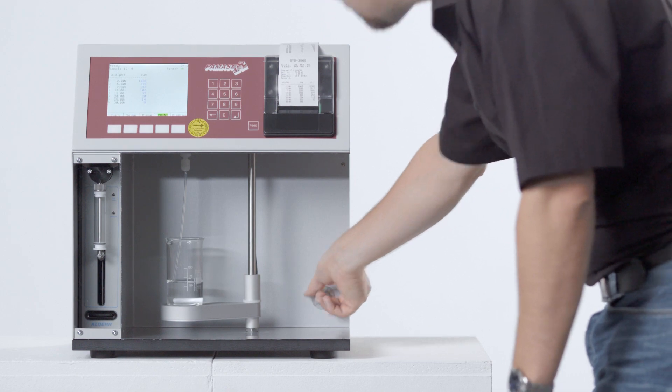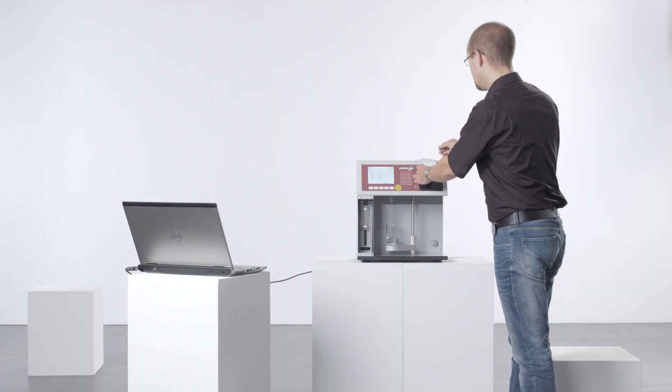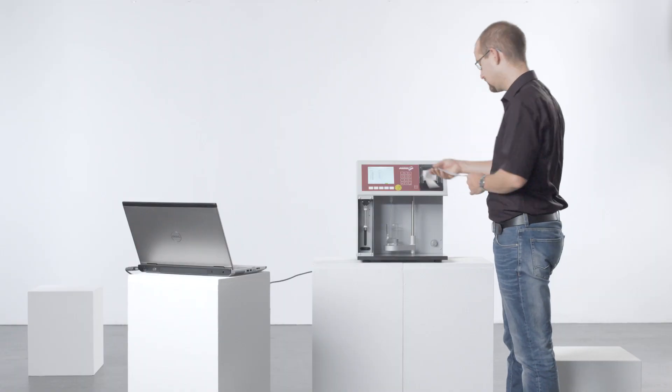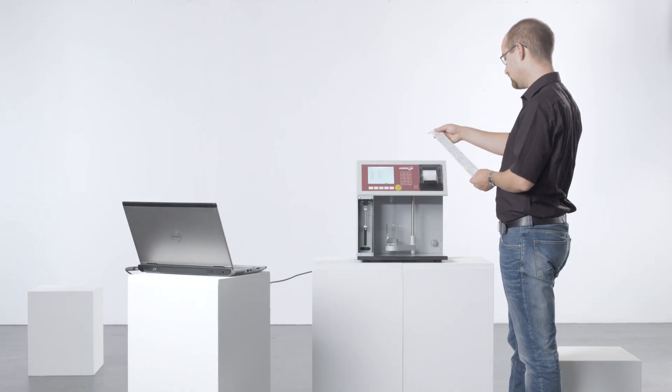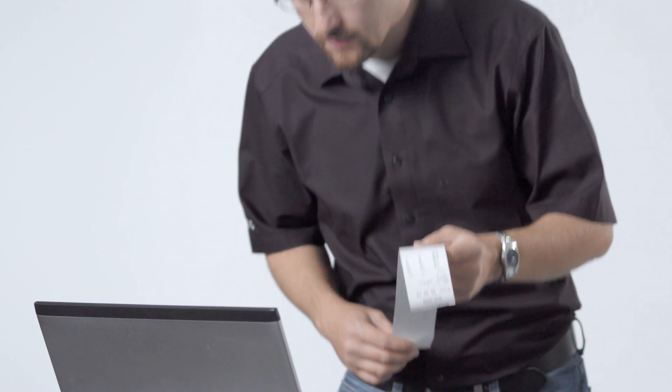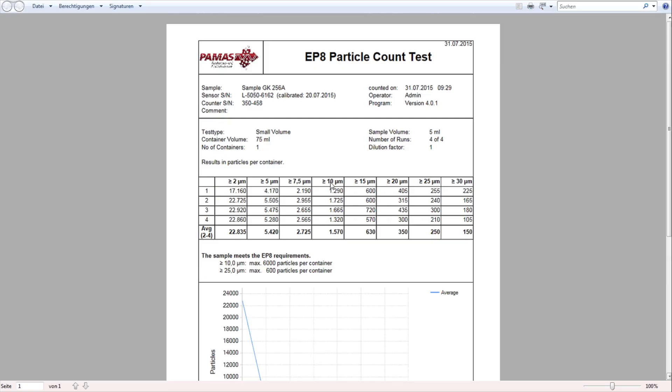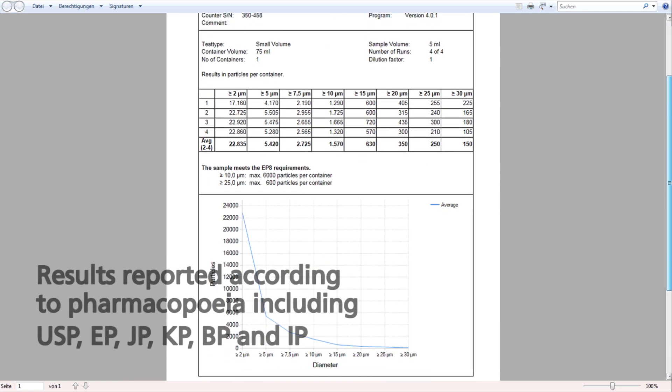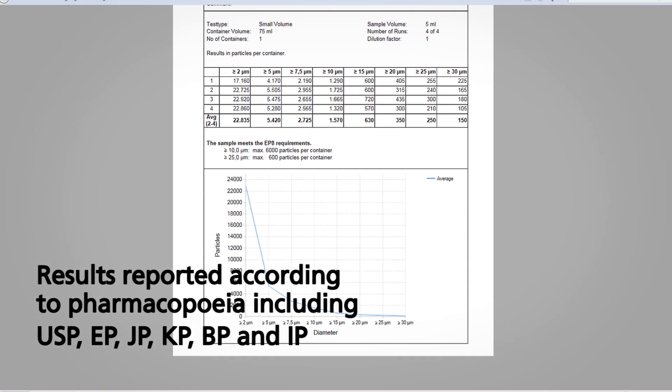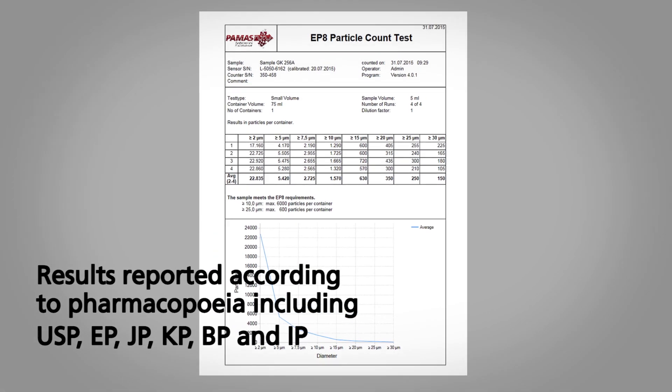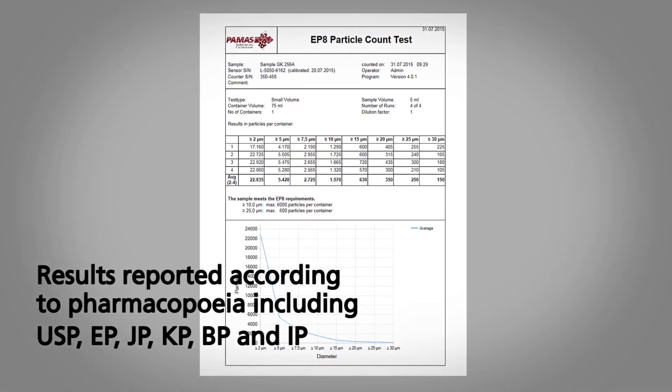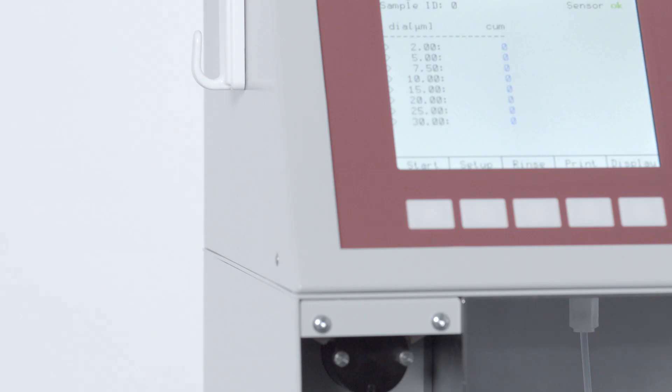The instrument is equipped with 16 freely selectable size channels for the particle count report. With the aid of the PAMAS USB software, the measuring results are reported according to common pharmacopoeia standards.